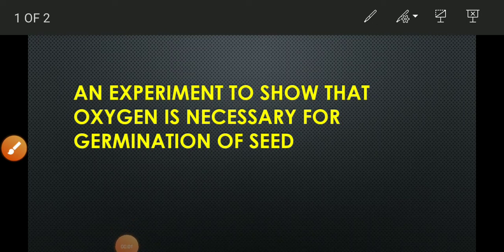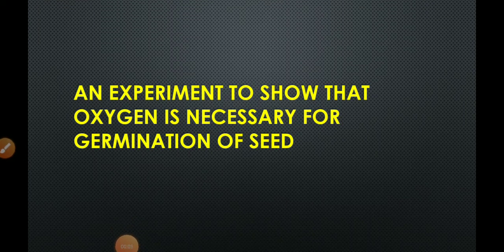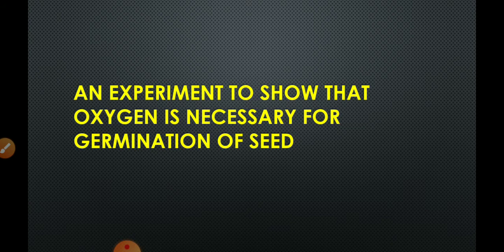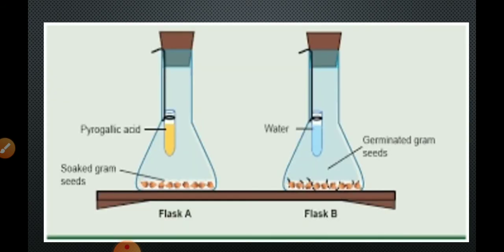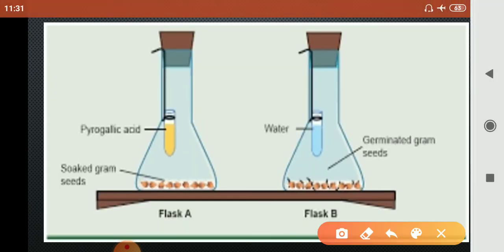Good morning children. In this video we will study an experiment to show that oxygen is necessary for the germination of seed. Let's see the setup. First of all, this is Flask A and this is Flask B.